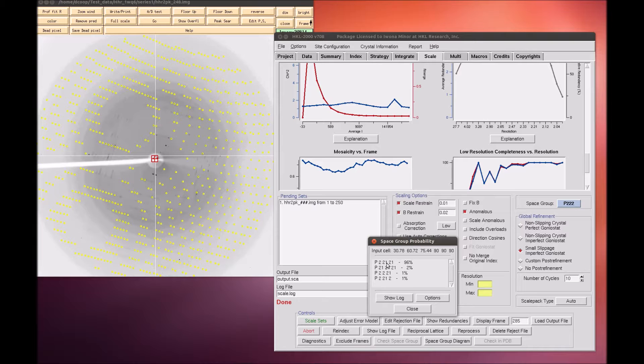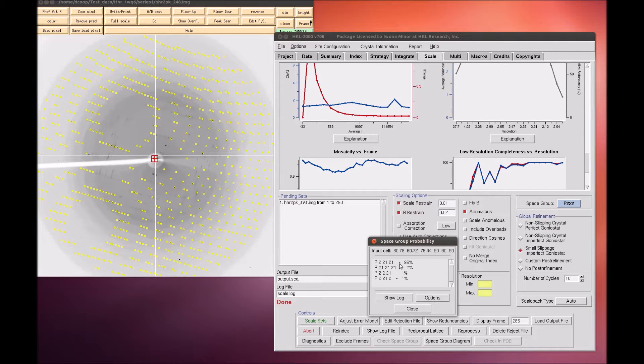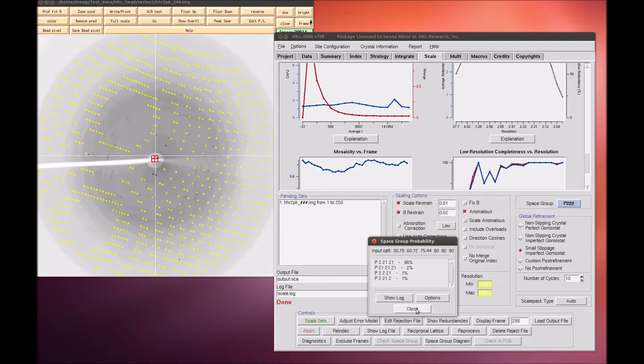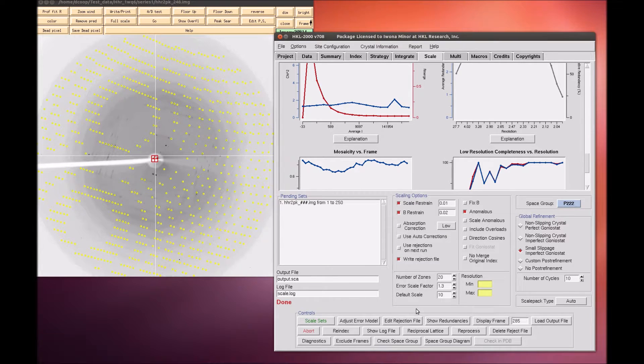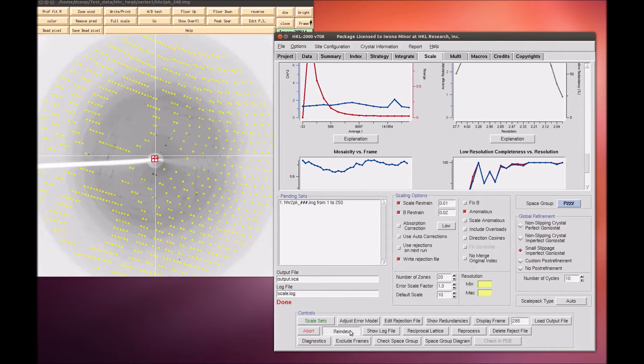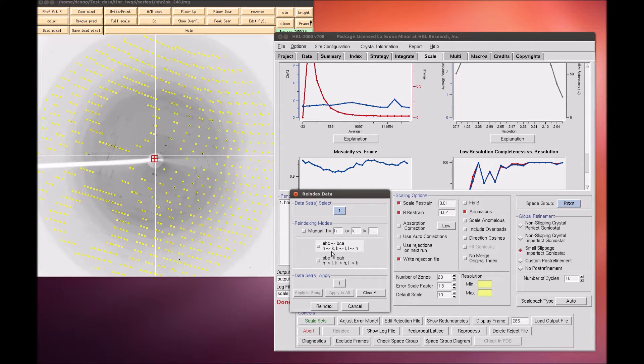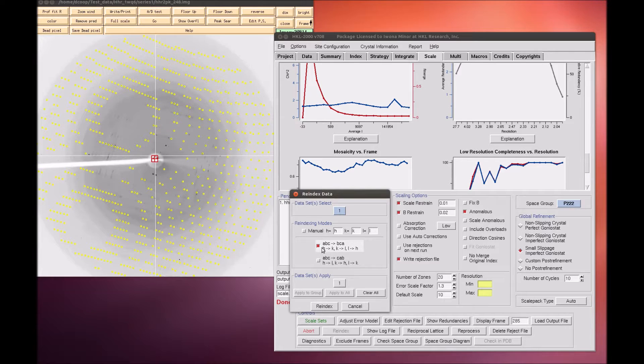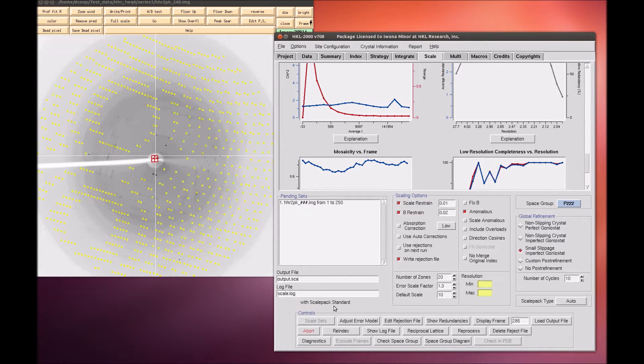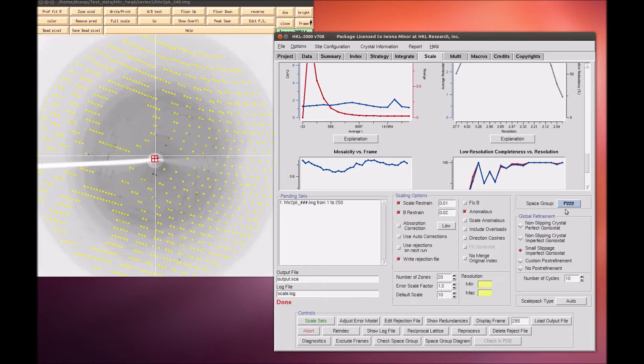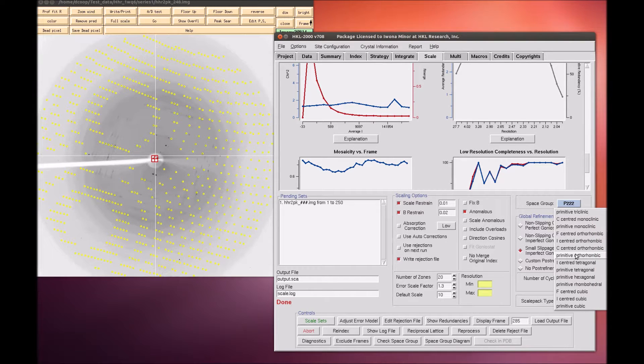In this case, it suggests that the space group is P22121, which is a permutation of the P21212 space group. In order to transform this into a standard space group setting, select the Reindex button. In this case, we need the axis without the screw axis to be on the C axis, so we will select ABC becomes BCA, and select Reindex. Now we can select the P21212 from the space group selector and scale the data again.